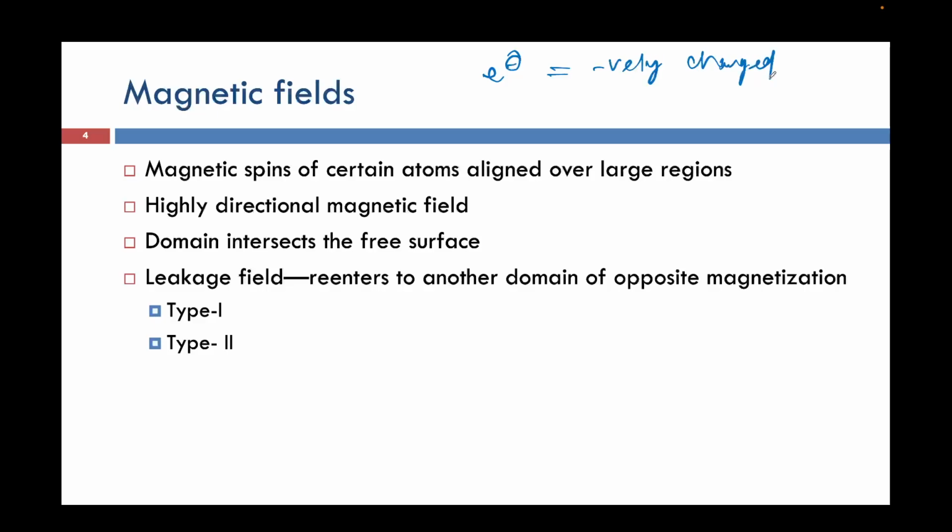Since electrons are negatively charged, incident electron beams experience some amount of force when they come through a magnetic field. That force is given by F = eV × B. Due to that, from a direct path they first become a spiral path, then a helical path. So this was the reason.